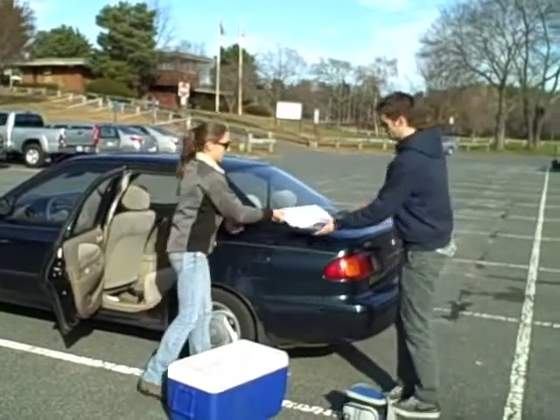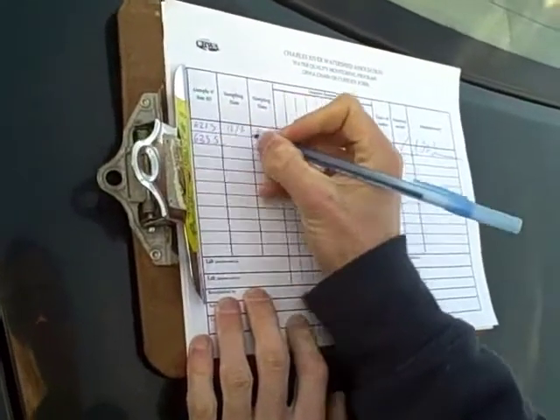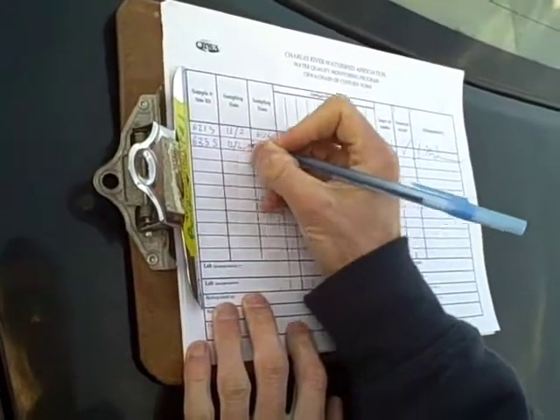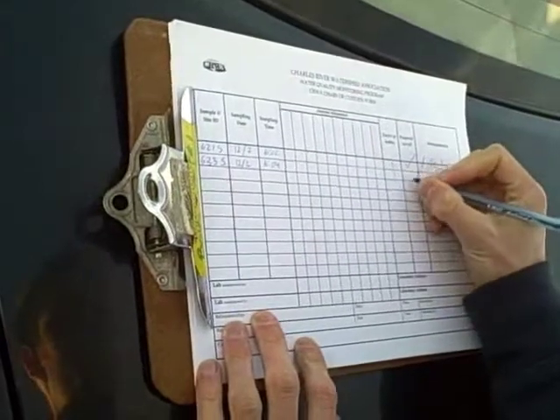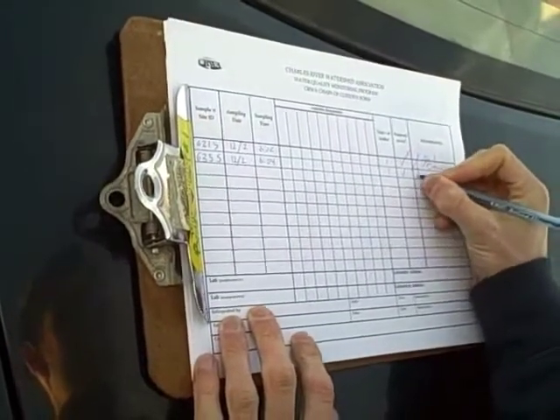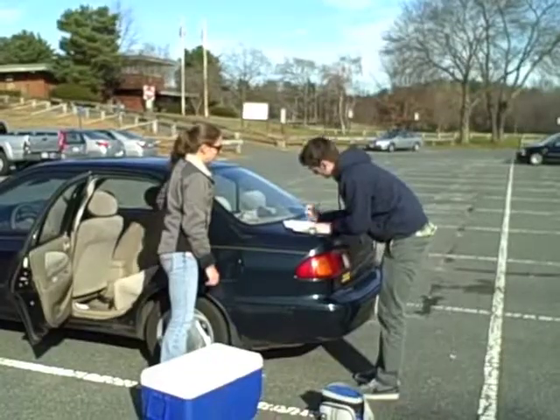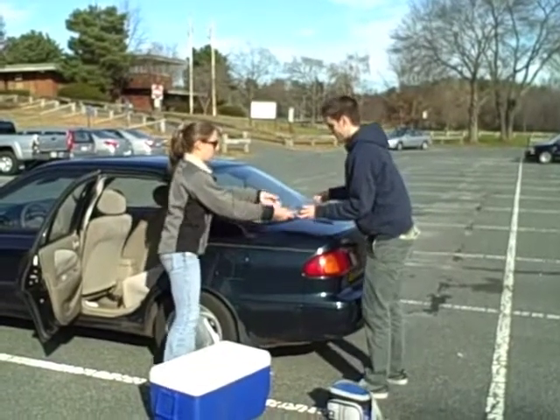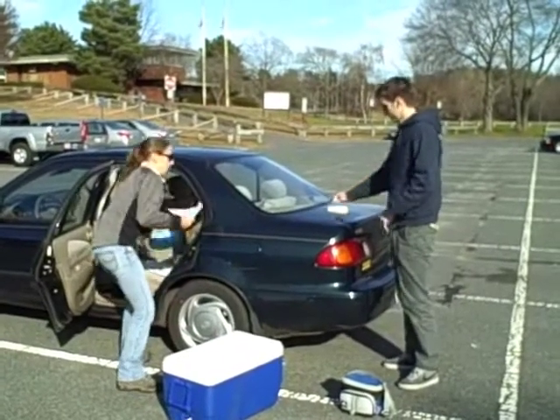Next, be sure to fill out the chain of custody form completely. This includes noting your site number, the date, the time you took your sample, not the time you're filling out the form, how many bottles you turned in, and whether or not you preserved the sample on ice. Lastly, make sure you sign your chain of custody form entry. These are essential for tracking each sample from collection point through all exchanges to its final destination at the lab.